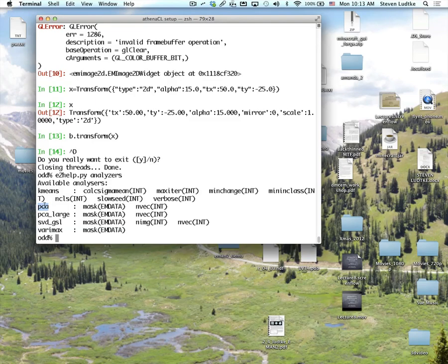The idea is if you have a whole bunch of data and you don't know how the data may be correlated, it allows you to find the strongest correlations in rank order among a stack of data. I didn't bring along a very good example for this. Let's say I have a whole bunch of photographs of 3 different people, but the images are really noisy.